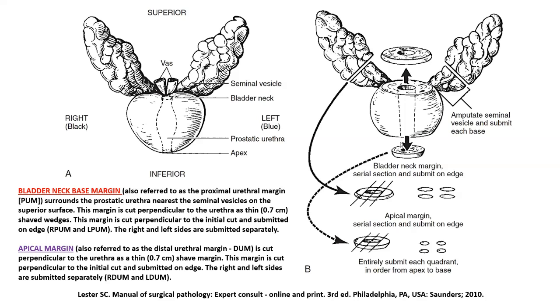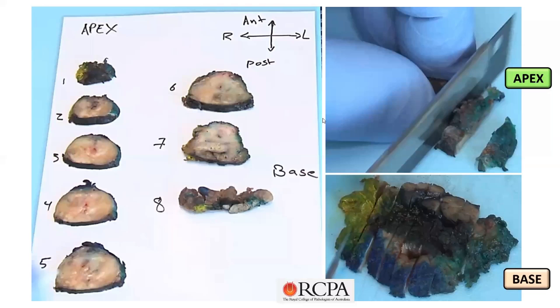And now you are left with the bulk of the body of the prostate, which you will have to section parallelly as multiple sections. If you see the order in which these levels are laid out, you start from the apex and slowly make your way up and end with the base. This kind of labeling as 1, 2, 3, 4, etc. helps you orientate the specimen when it comes to grossing, and also to have a microscopic idea when you see the slides.